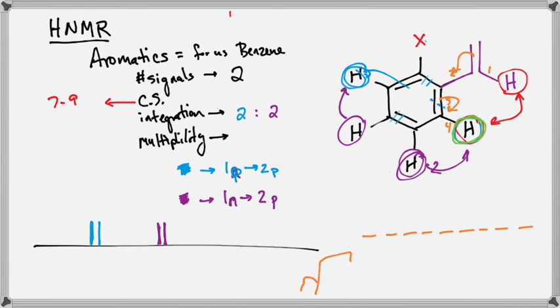So if you look at the signal that integrates to, what was that, 2.5, 2.05? That 2.05 is probably the easiest one to look at. If you look at its peaks, it's not a single peak. It goes up nice and neatly as a single peak, but then at the top, it's got a bunch of little divots. Okay? For the sake of the recording, if you look at the signal, you see something like this, more or less. Okay? What is starting to happen is long distance splitting.